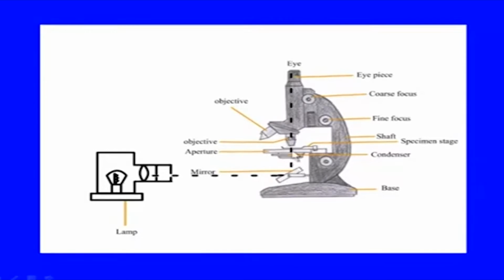The light passing from the condenser will illuminate the object in a very small cone of light, which is focused on a very small area, and all stray or extra light is avoided by the apertures and iris, which are placed at different places.